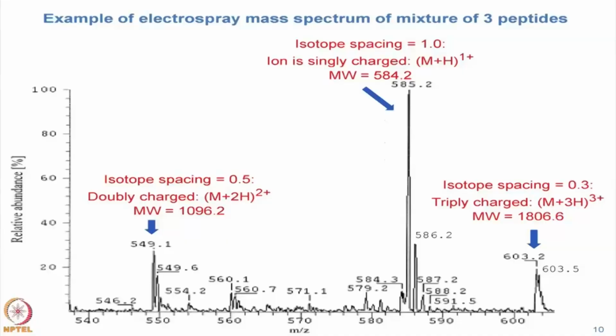Here is an old slide that illustrates an MS1 spectrum. There's a few things I want to point out here. This is measuring multiple peptides at one time, and you can see that this one is a singly charged peptide. Its isotope spacing is 1.0. This one over here is doubly charged, and then I think one's triply charged here, right? So the spacing is 0.3. You can tell from the resolution or the peak widths there that this is an old instrument, okay? Those things are wide, okay?